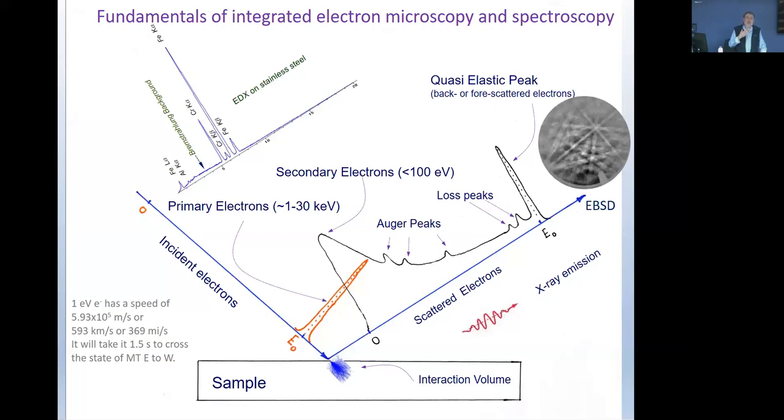It worked for us, but it's case by case. If you are interested in a combination of 2 or 3 materials, you look at the Auger profile and see if it's different from, say, the pure version of one of those components. It's not easy. But good question, we have to test these ideas.